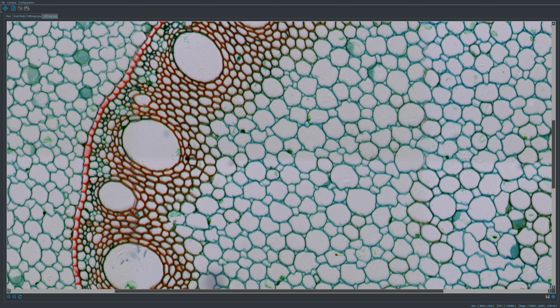And if you go back to the folder after scan, which is based on the time, this is the last one we need, and this will be the image here. You can zoom in and zoom out to these files, and similarly to any of these files, and the file names are based on the position of that.